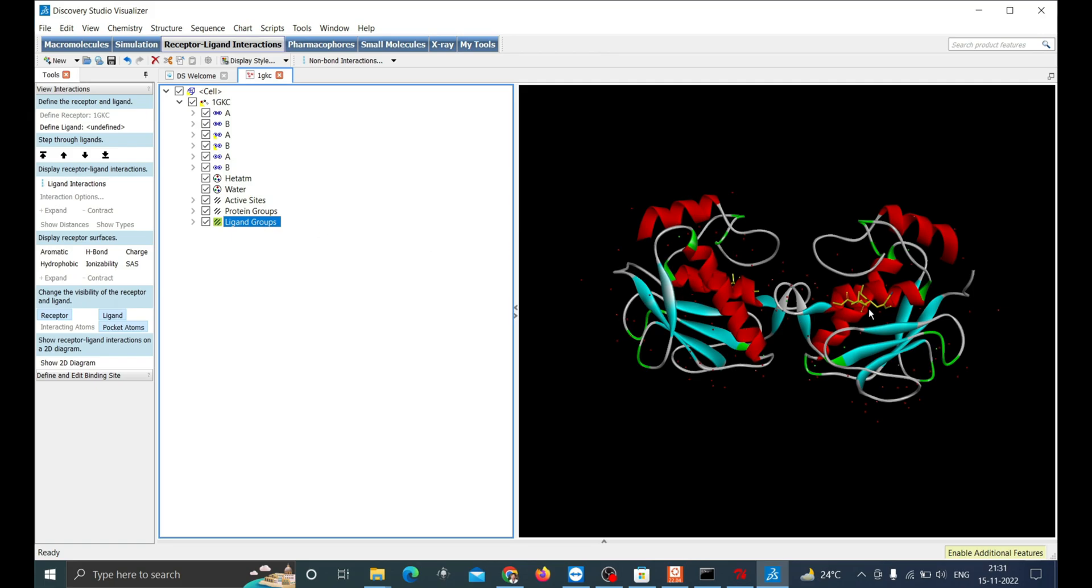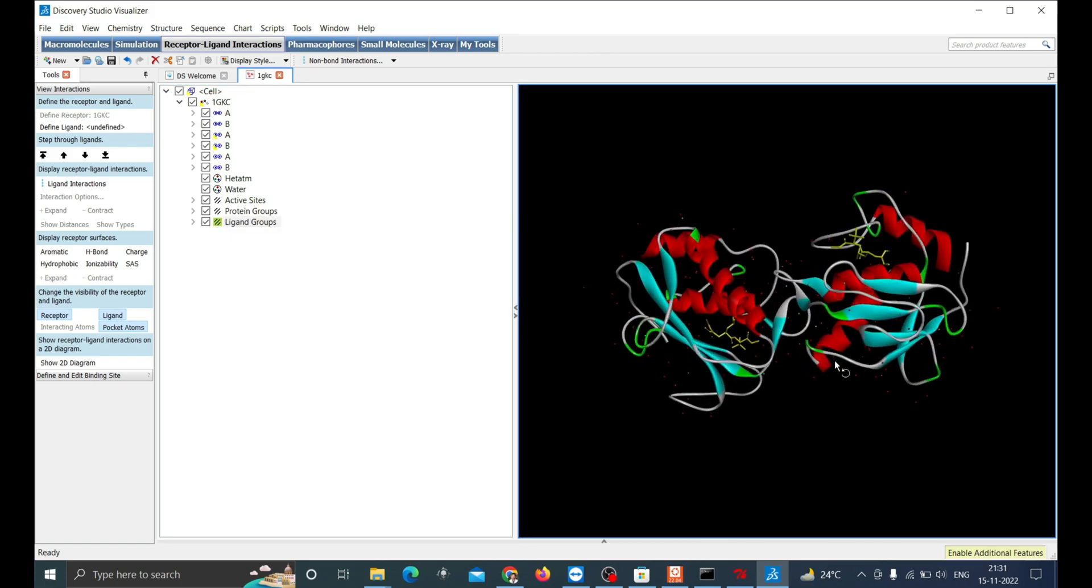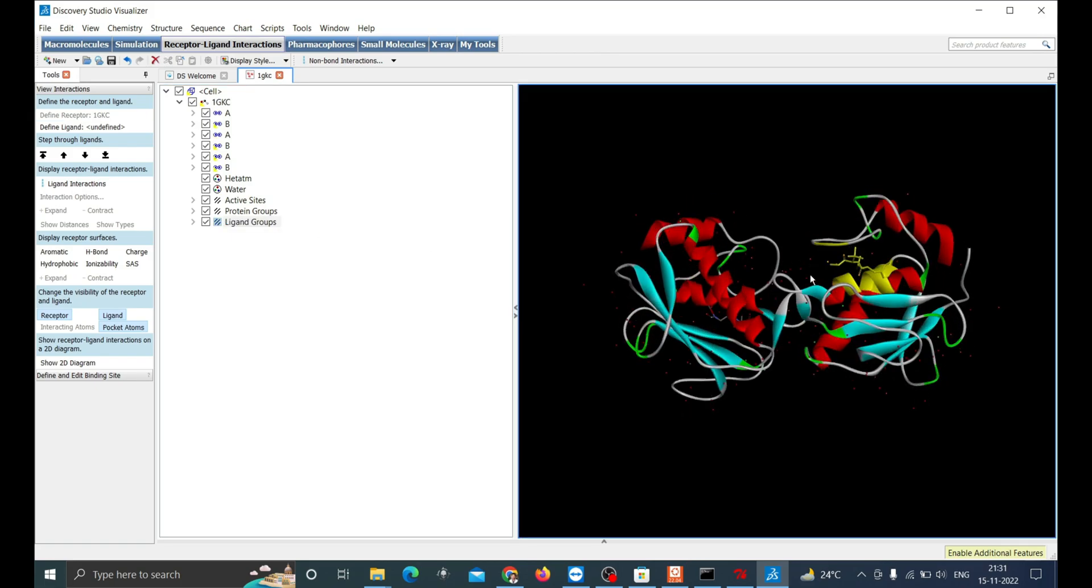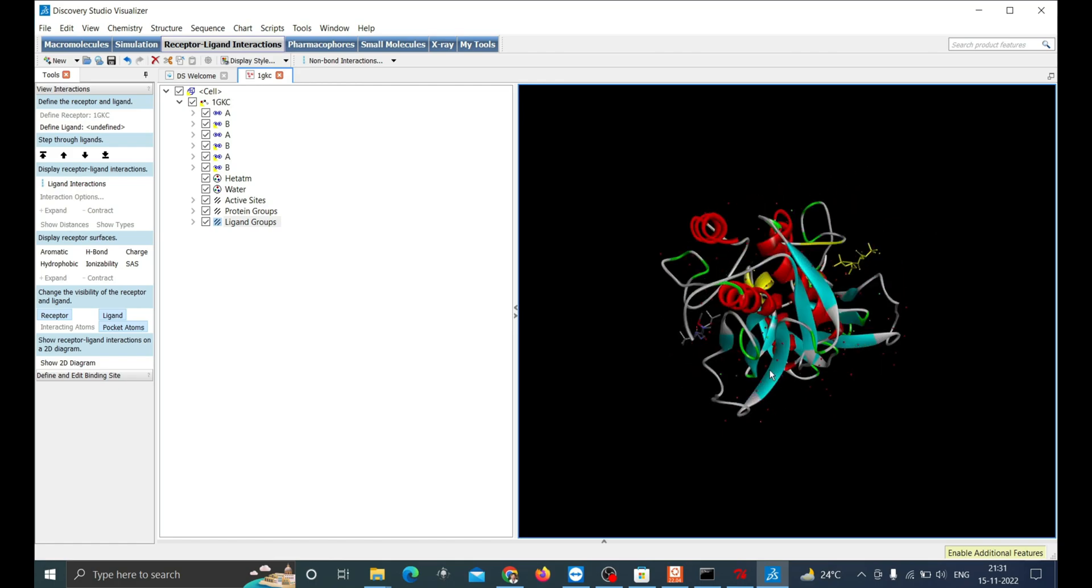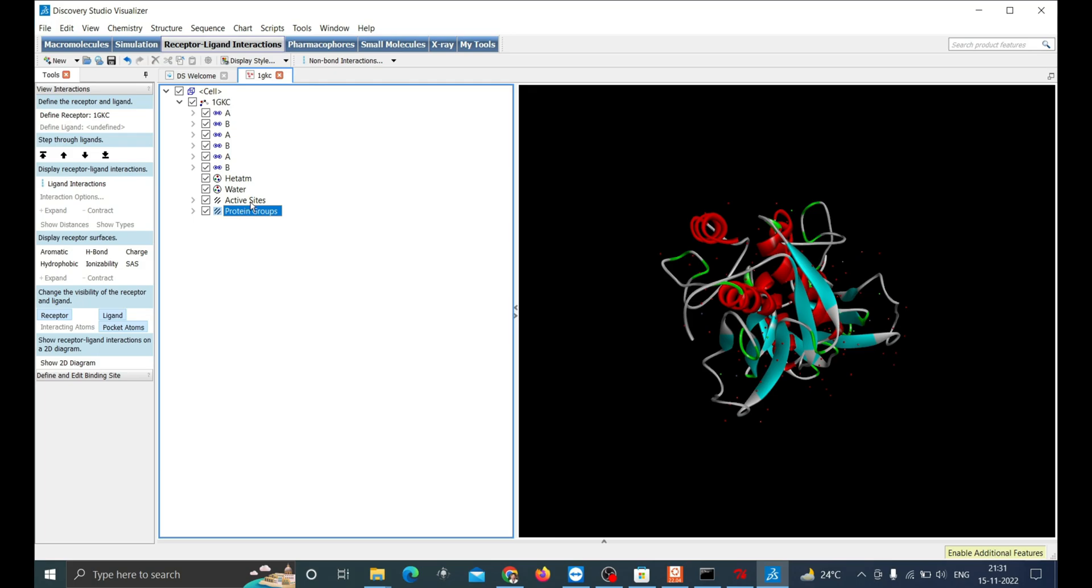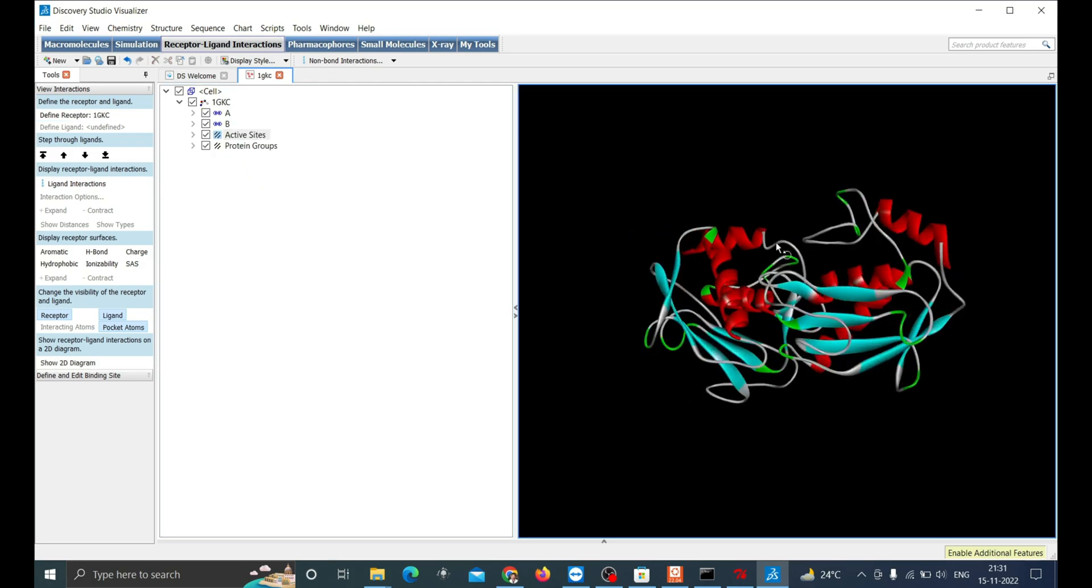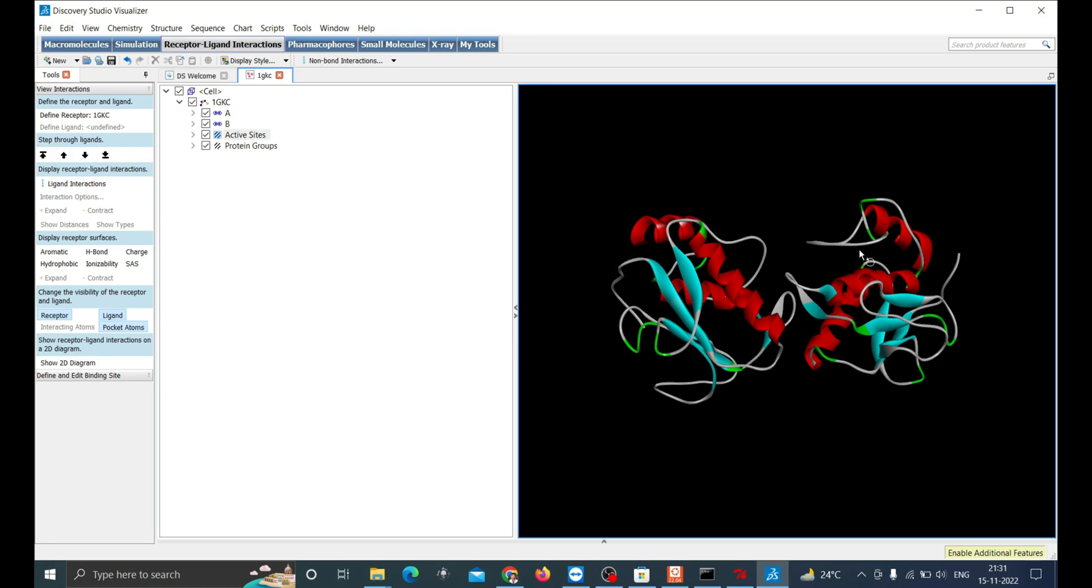Now when we click on the ligand group we can see it as highlighted in yellow. We can remove that ligand by simply pressing the delete button after selecting it, then delete HETATM.